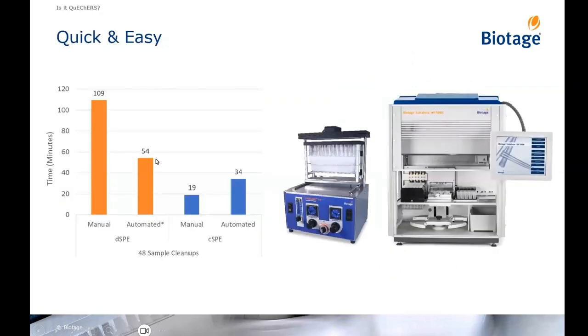So if we look at quick and easy, for dSPE, if you did a manual shake of your samples for the cleanup, and this is 48 samples being cleaned up, and the orange bars are for dSPE. If you did a manual shake, which we did two tubes per hand, so 4 samples at a time, manually shaking it by hand, which isn't fun. But it's actually relatively quick. It takes under 2 hours to do, and that's actually not bad for 48 samples. Now, some labs are doing 48 plus samples a day, so that could get pretty tiresome.